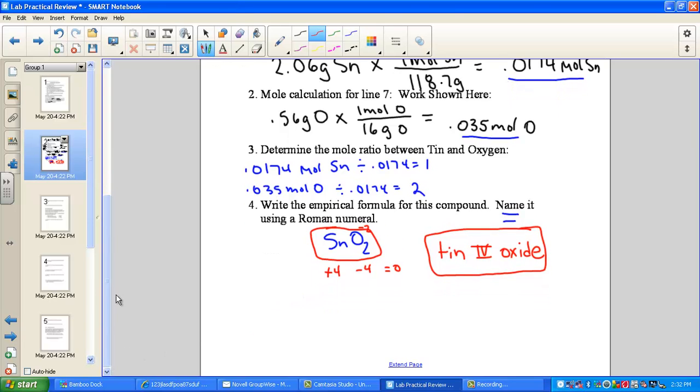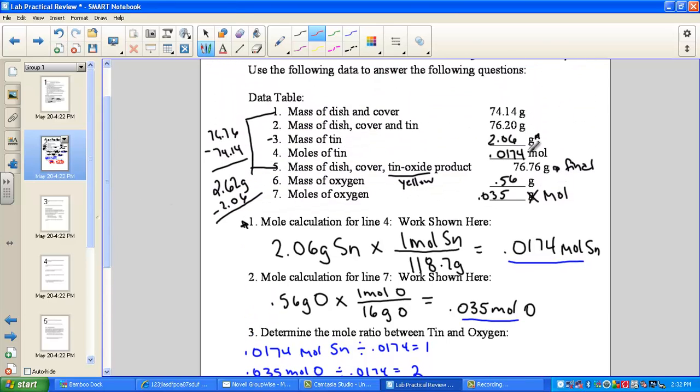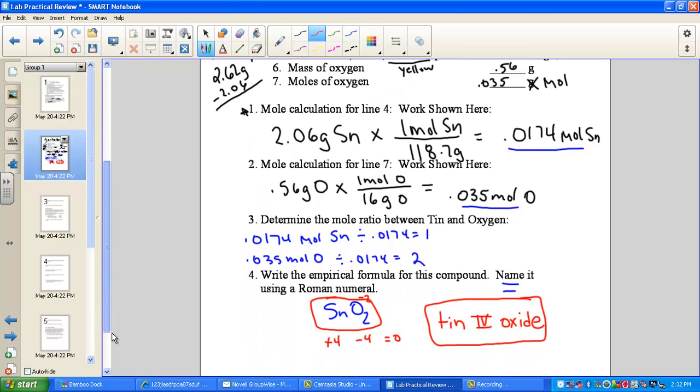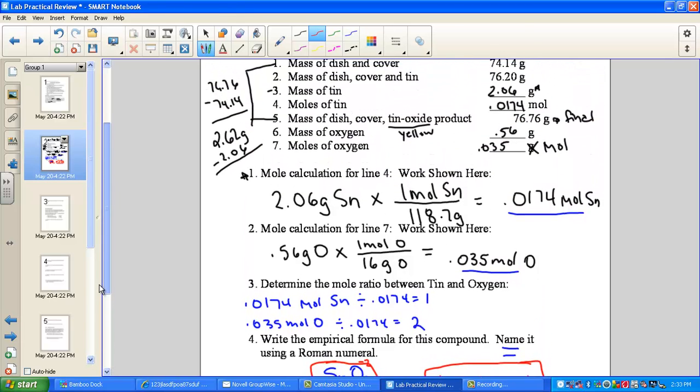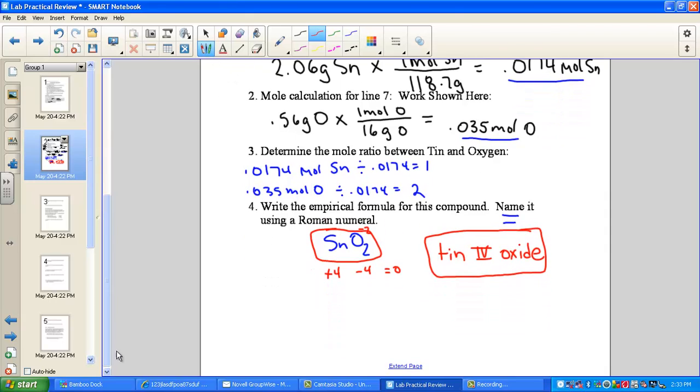In Part A, we can't stress enough how important it is to take accurate measurements. Make sure you have plenty of drying time. Make sure that you've dried enough to where you're seeing a nice bright yellow color. Then take your final weighing. You should practice with this data table until you feel confident that you could process it without any help at all. Remember, this is going to be turned in before you take your test. You're not allowed to use this. It's a practice. So turn this video on, pause, practice this data table, and pick up with Part B when ready.